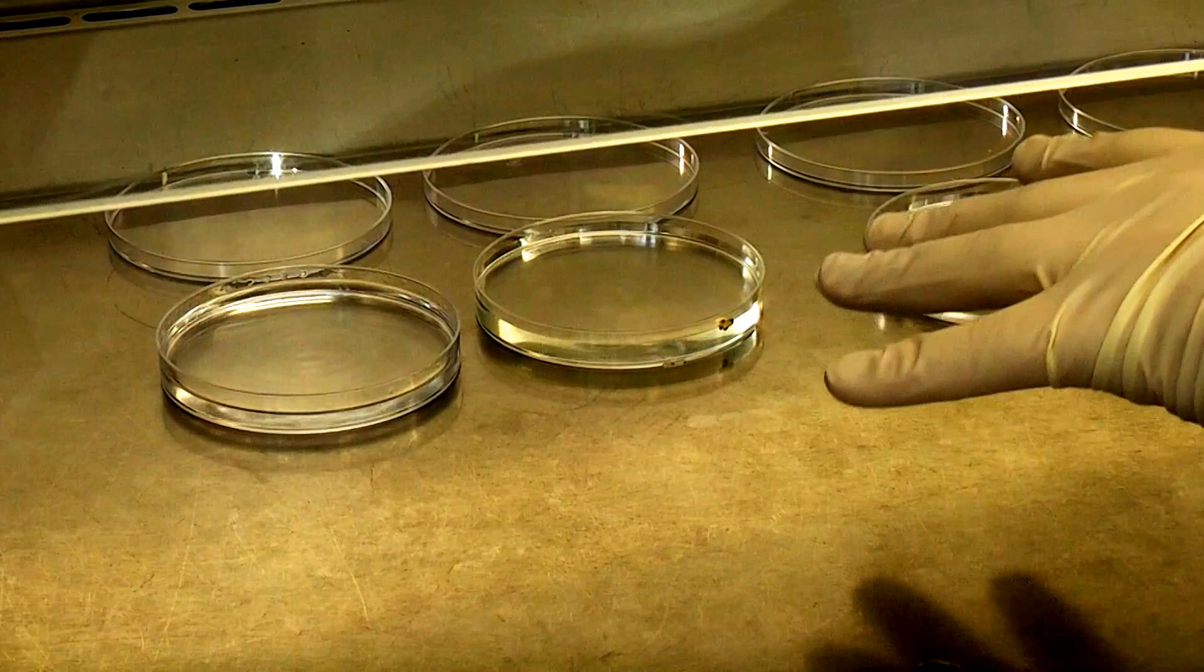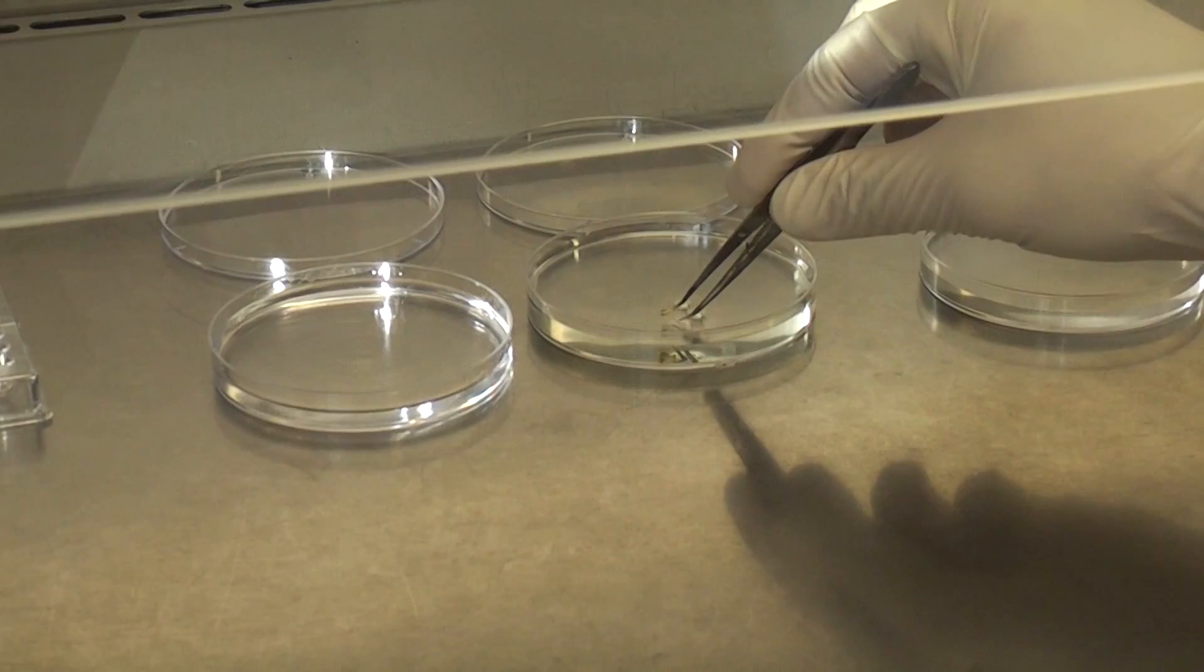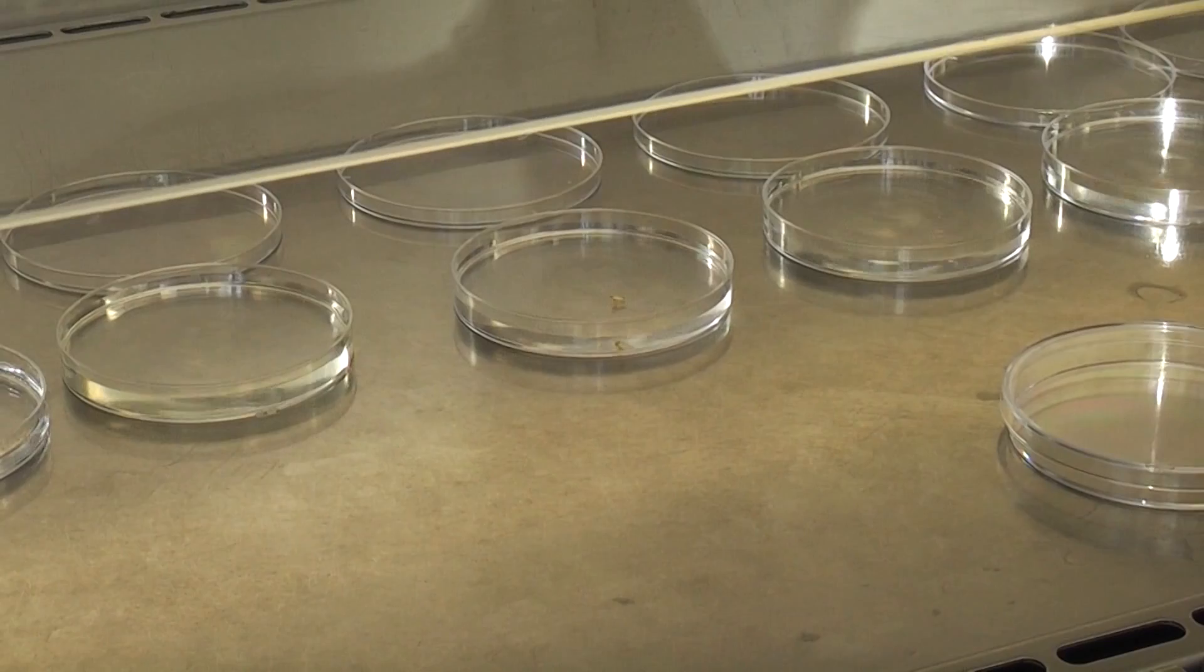Alright so that nodule has been in the bleach for about 3 minutes. So I'll just take it out when I catch it. Sometimes this can be hard. And put it in some sterile water. Now I tend to leave it in the first petri dish for a little bit longer and the rest just helps it to remove as much of the bleach and alcohol as possible.